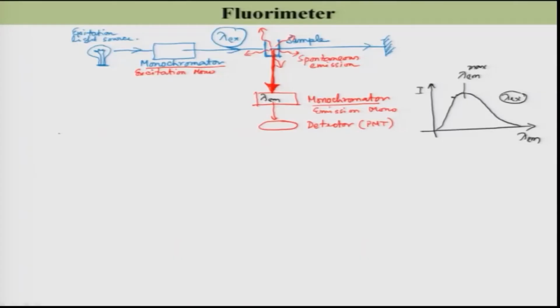What I wanted to say, first let me say that clearly: the light source, monochromator and detector, they are not ideal.